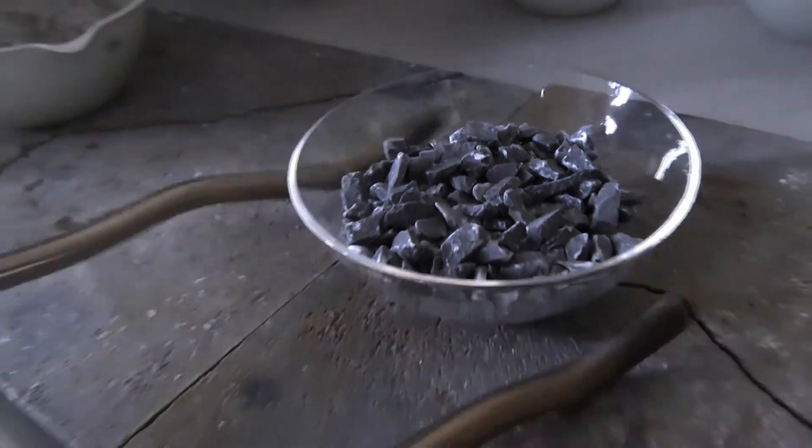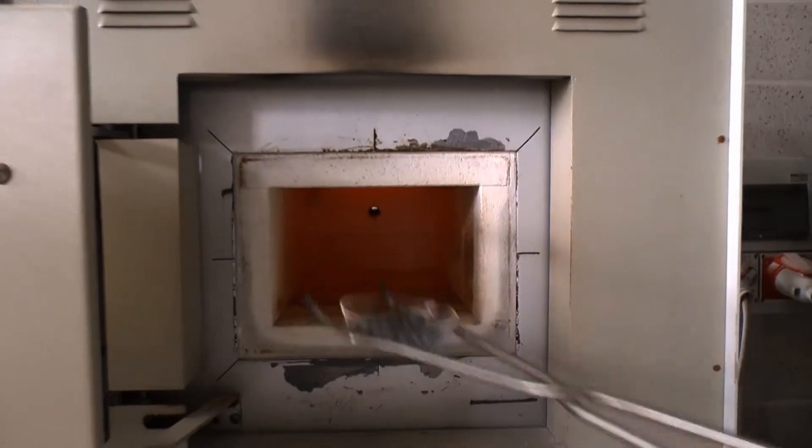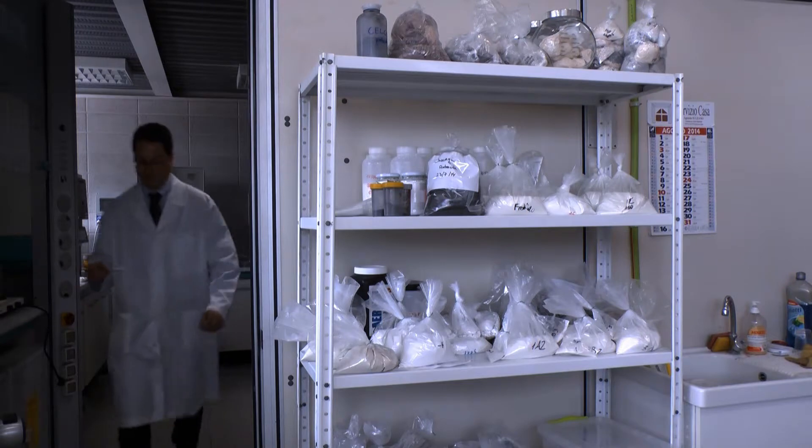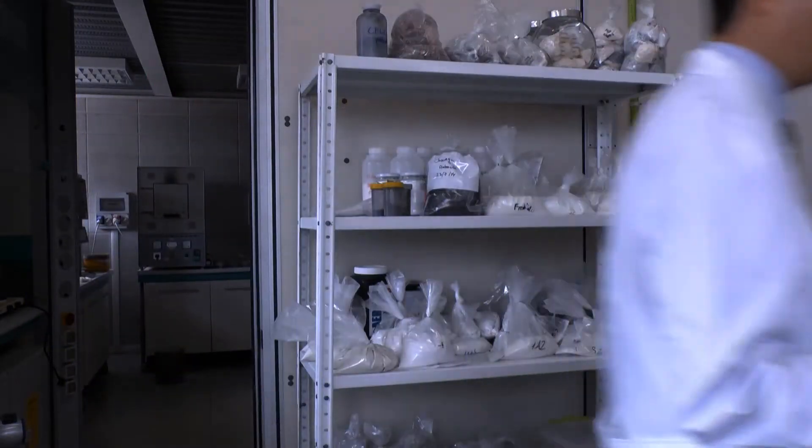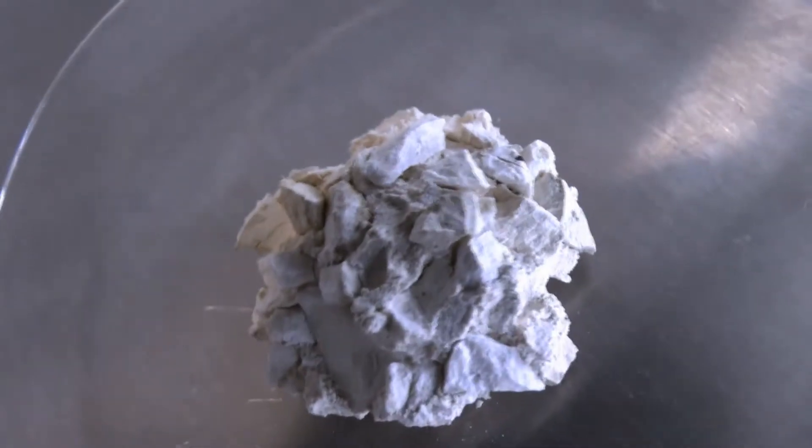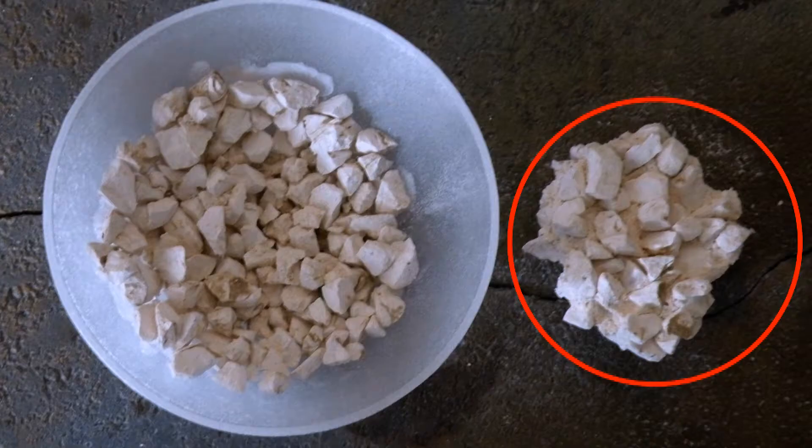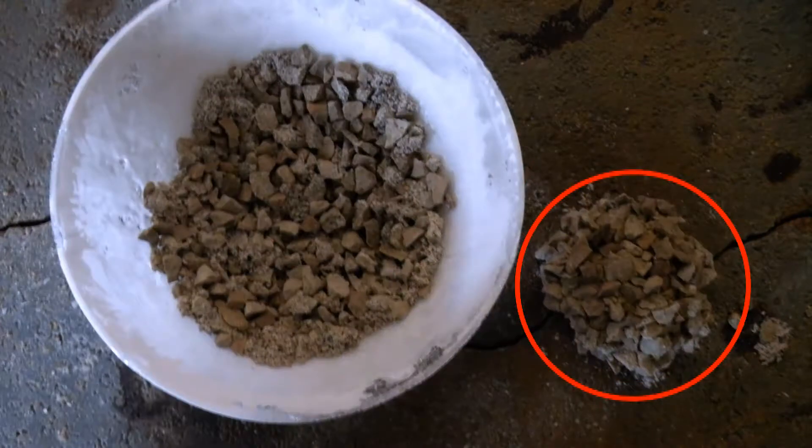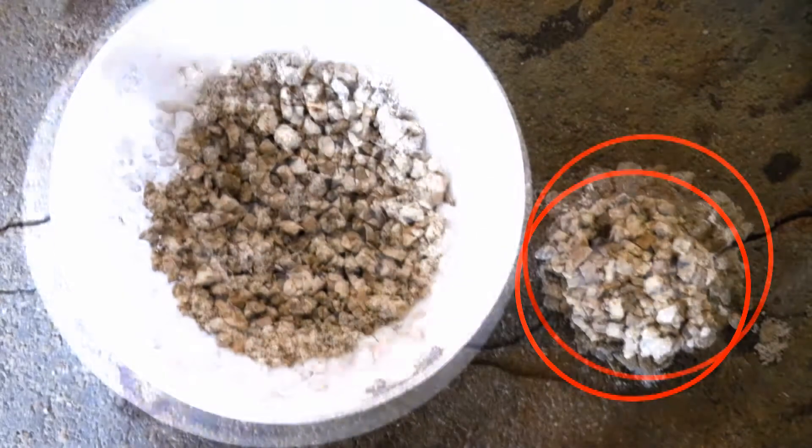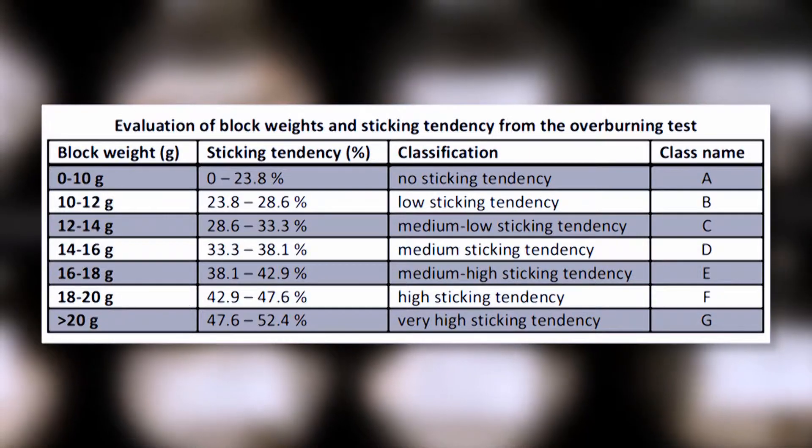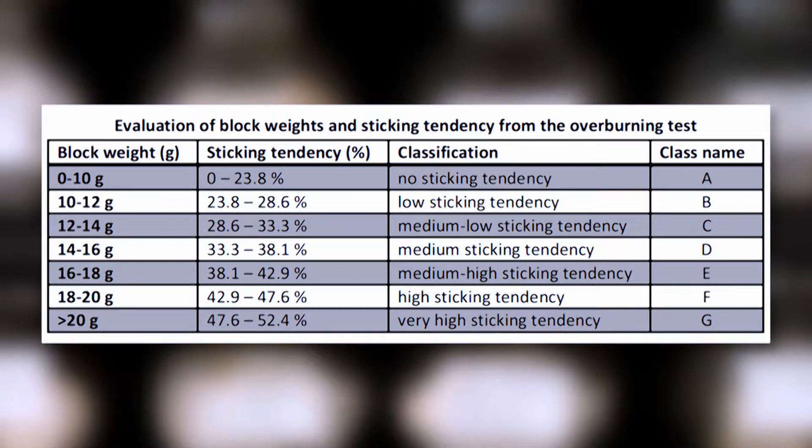The crucible is placed into the muffle furnace at 1300 degrees centigrade. At the end of the test, the crucible is cooled for a while. The preliminary visual inspection allows us to evaluate if the sample is partially melted and weighed. The cleaning operation must be done as quickly as possible because blocks upon cooling could have a tendency to disintegrate. Finally, block weights and sticking tendency are calculated.